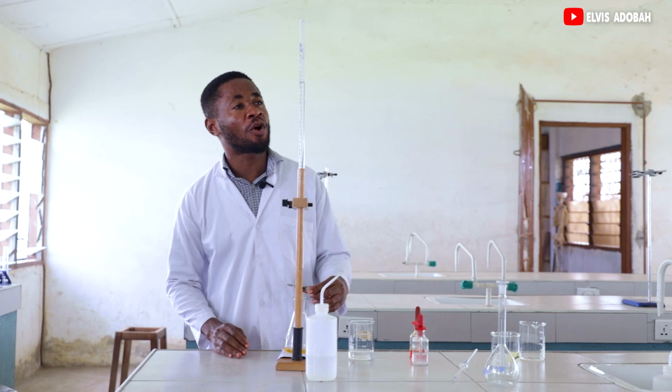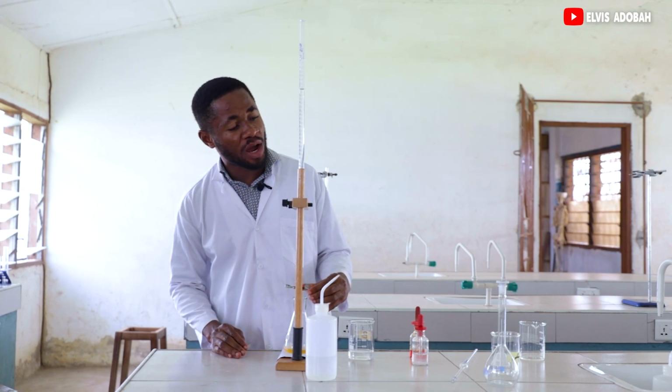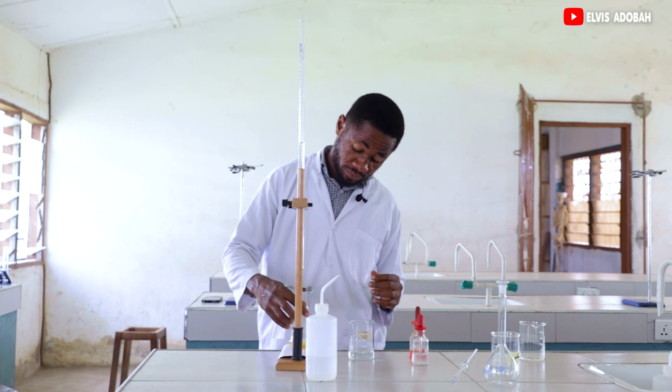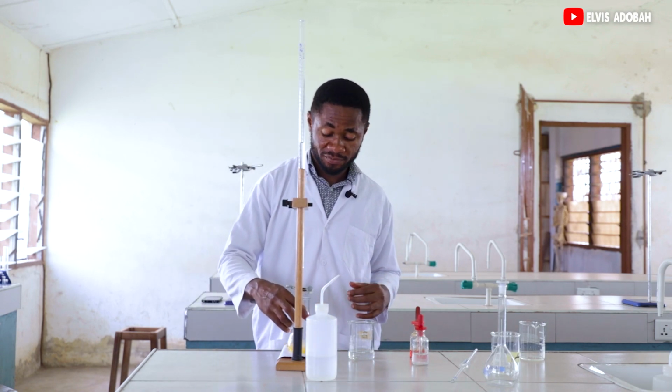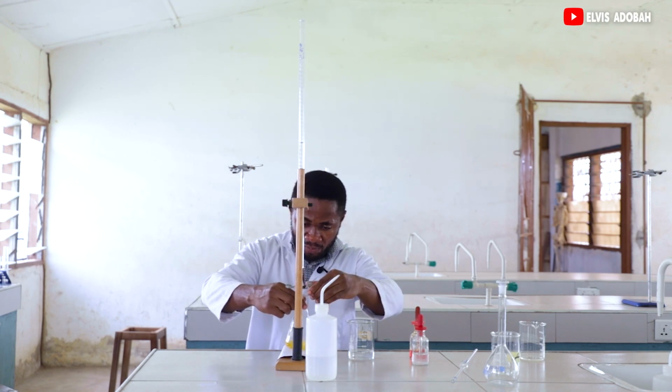So we release from the 4.8 till we get to somewhere around 20. We will swirl and continue with our titration. By this time, we will add the acid dropwise so that we can catch our endpoint. Then we take our time. We want to catch our actual endpoint.